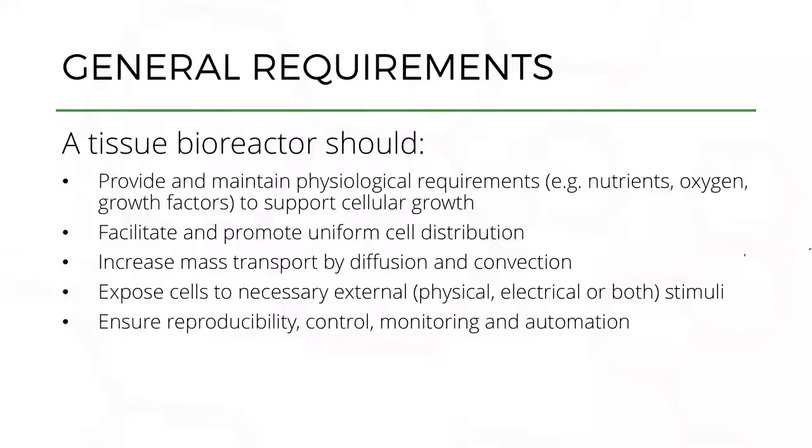Finally, one of the goals of the bioreactor should also be designed in such a way where you could ensure reproducibility. So thinking about what kind of monitoring processes or systems should be in place, and the availability of automation should also be a very important consideration here.